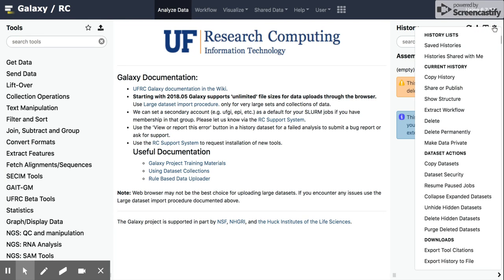And if you click on this, there's a number of things that you can do, including delete this history, copy it, share it, or marking it as hidden or private.